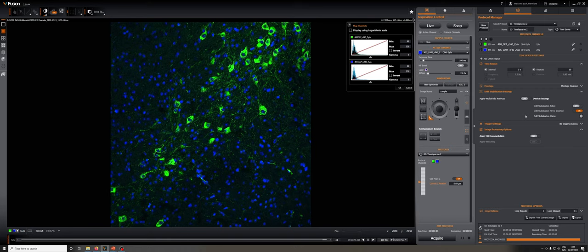For the drift stabilization to work, the drift stabilization mirror has to be inserted, and then you have to click on active, and if it can work, that will turn it on.